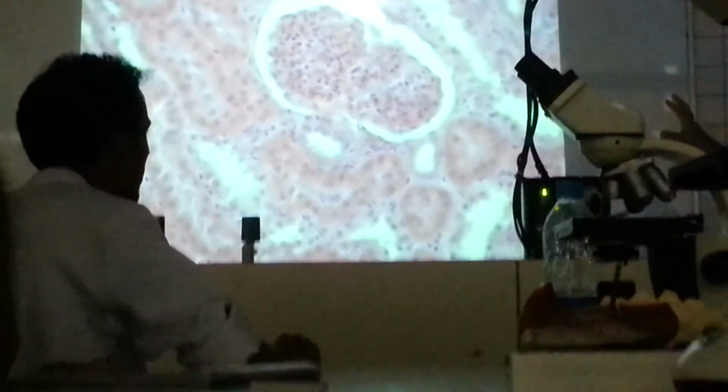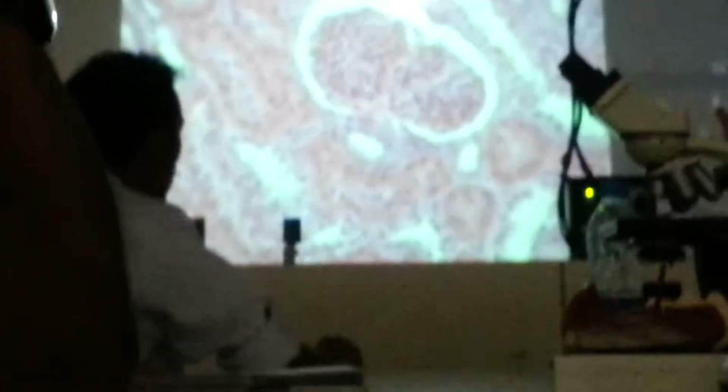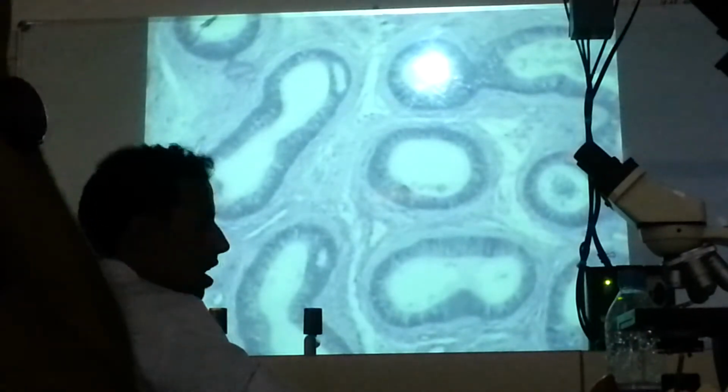No, the section will not be under the microscope. It will be data show. Because it has flattened nuclei. Flattened cells with flattened nuclei. Yes.